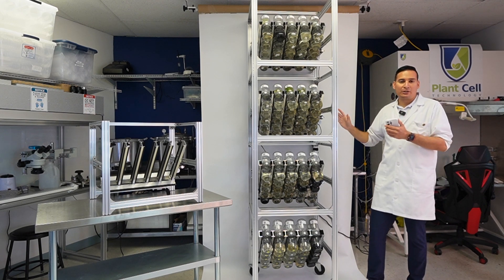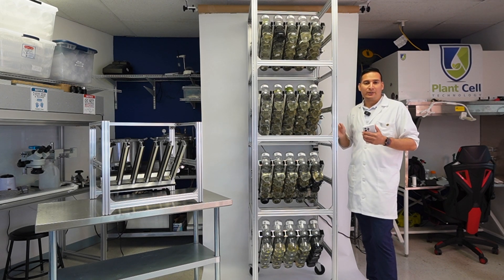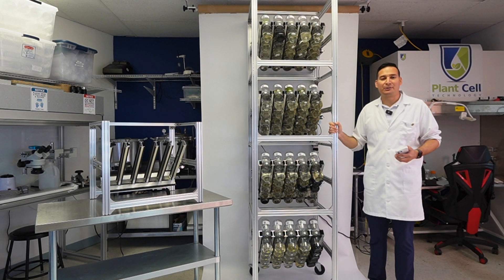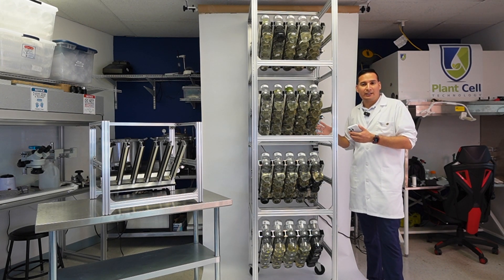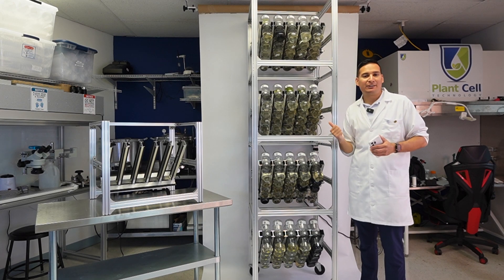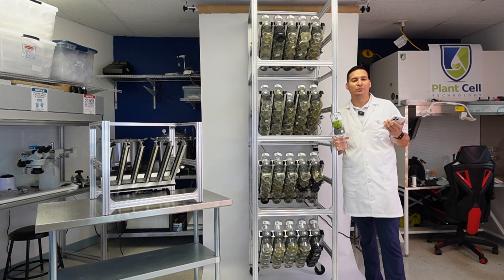You can grow thousands of plants using the biocouplers. Many people have already tested the biocouplers, they love them, and you can grow a lot of plants very fast. Now with a fully automated system, you can get a return on investment much faster than with a traditional temporary immersion bioreactor system, which is far more expensive. The BioTill is an economical way to get into temporary immersion bioreactor systems.